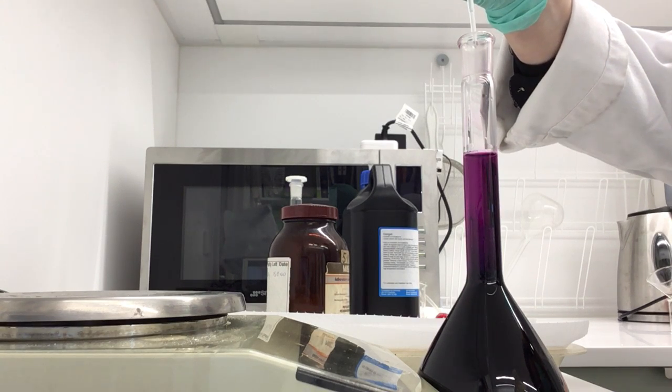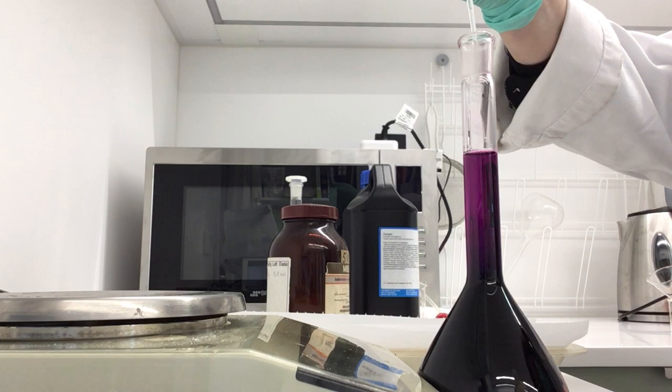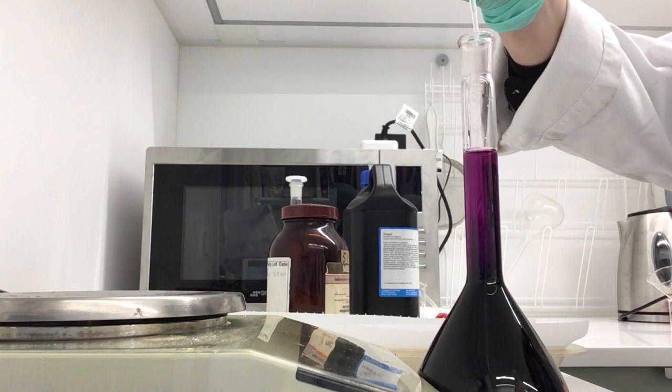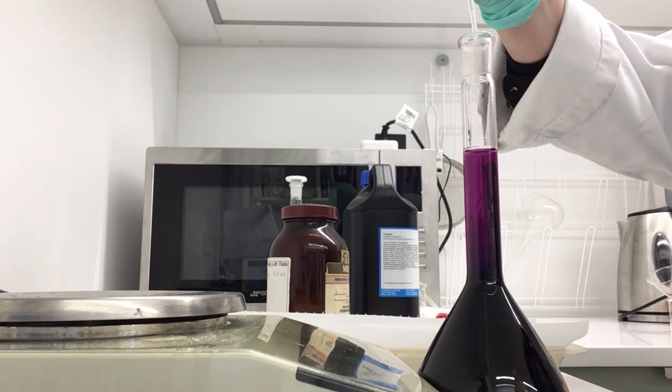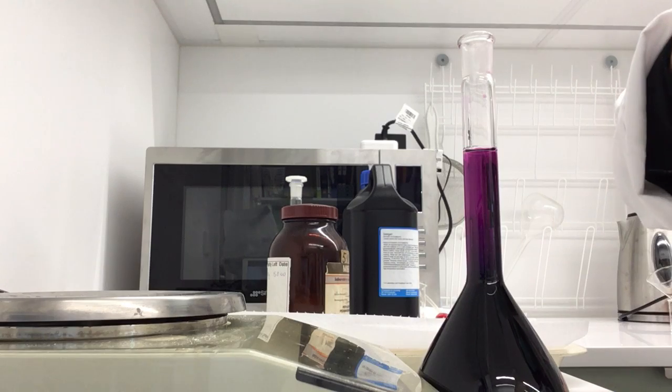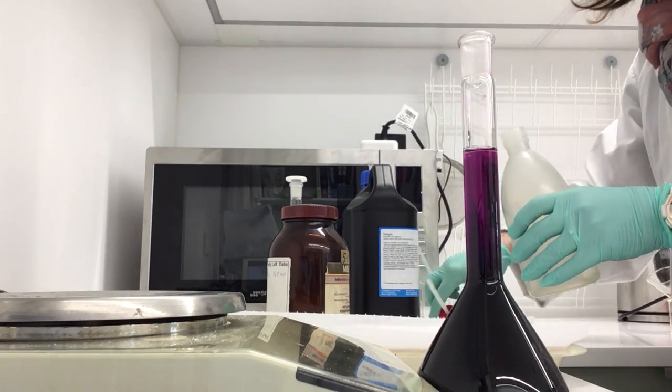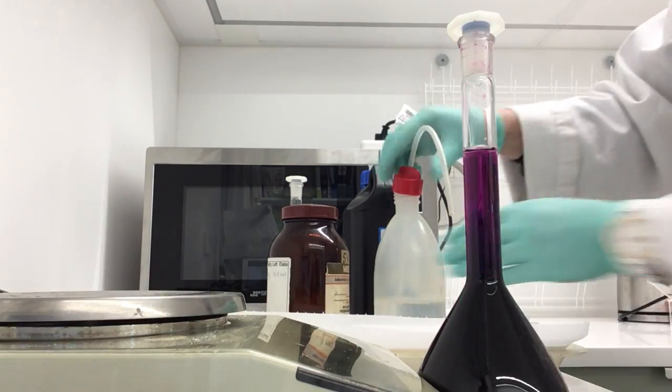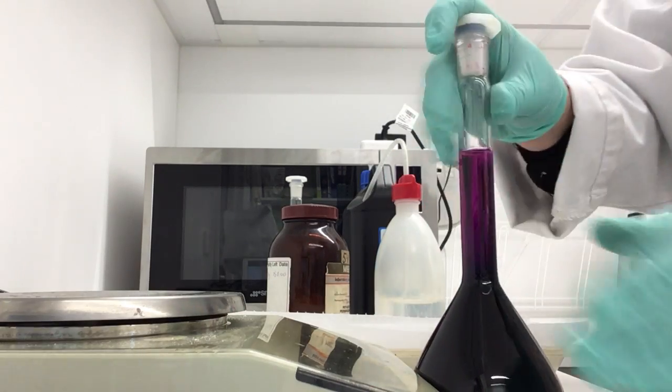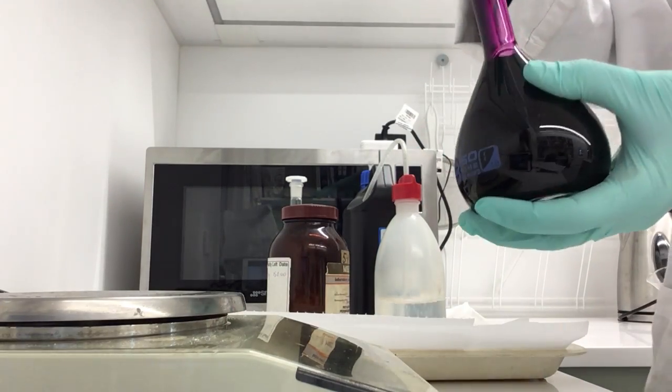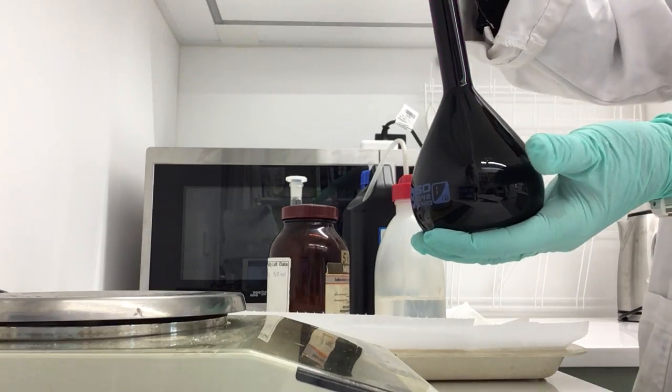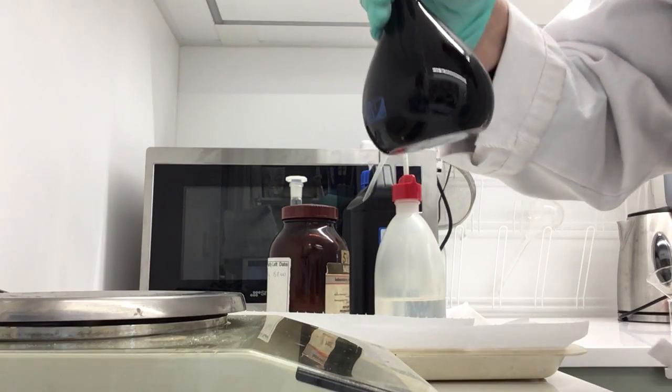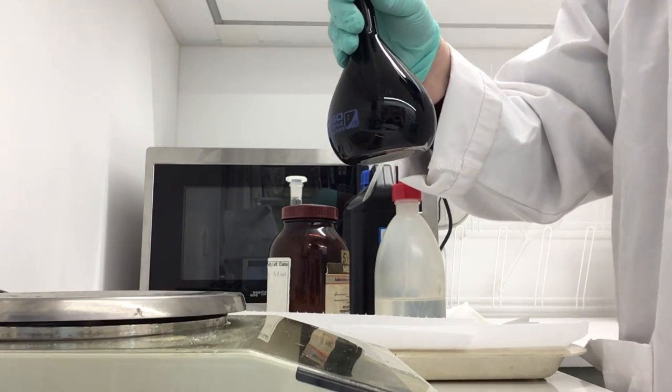Line on the flask that is, so that we know that we get the exact concentration that we're after. Okay, give that a last little mix, and that's our standard 0.02 molar potassium permanganate solution.